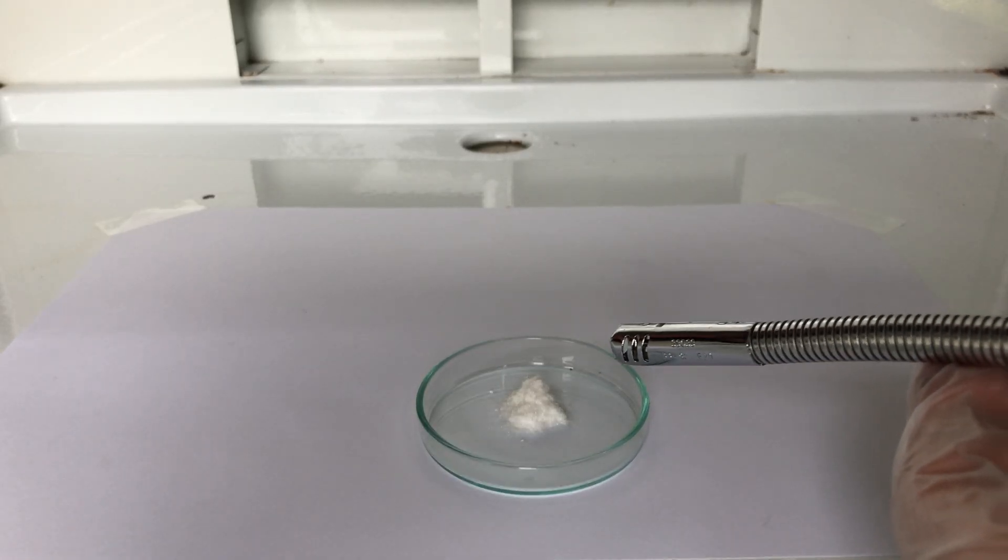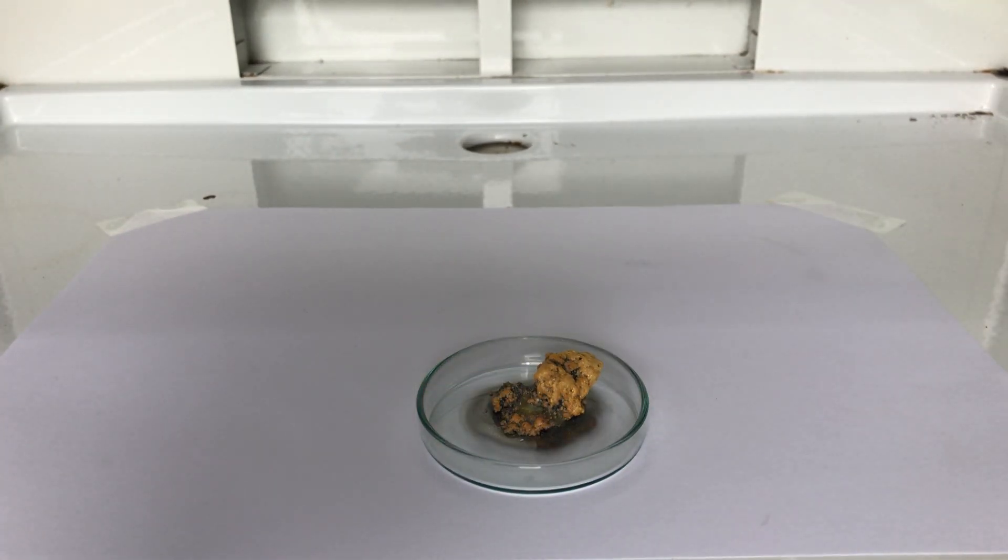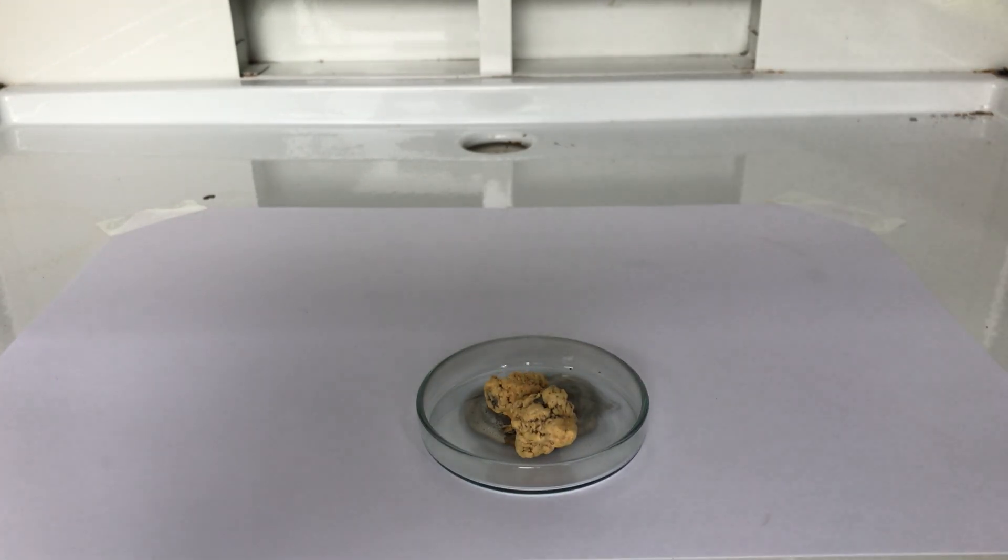When we light the mercury thiocyanate on fire, these beautiful snakes appear. Mercury thiocyanate decomposes to form carbon nitride, mercury vapors, carbon dioxide, sulfur dioxide, and carbon nitride further decomposes to form deadly dicyan gas.